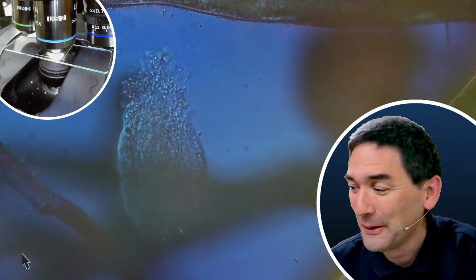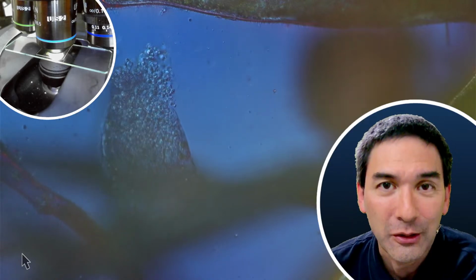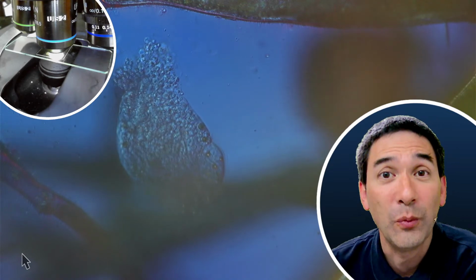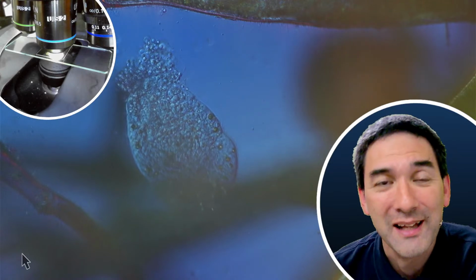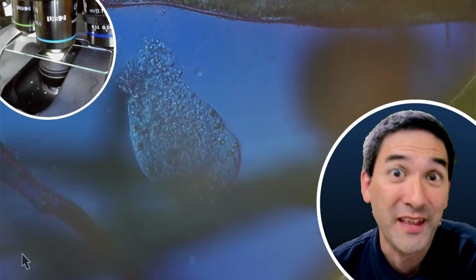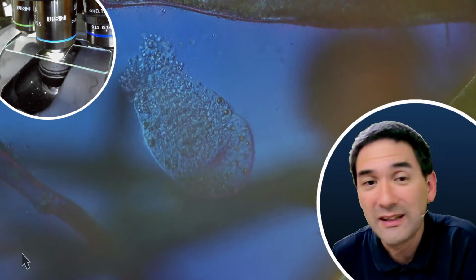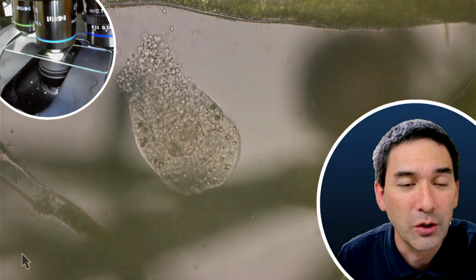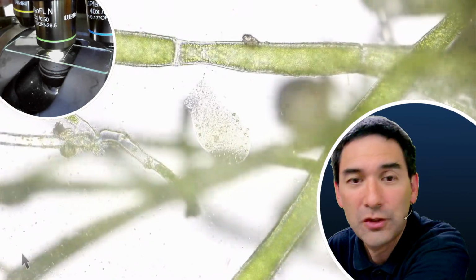For example, I've made some videos also about rotifers, which are also multicellular microanimals made of about 1,000 cells, and one paramecium is approximately the same size as one of those microanimals which is made of 1,000 cells. Yeah? Because Paramecia is simply so huge. So again, that diversity that we see in the microscopic world is really large. Yeah? But let's go down a little bit again with the magnification here.